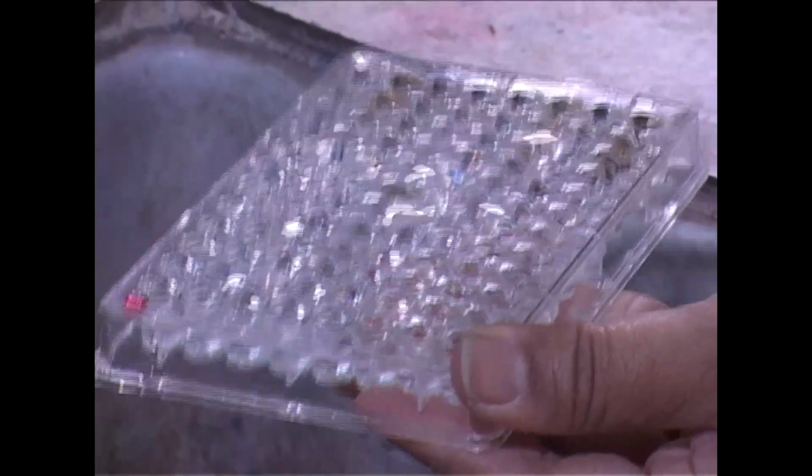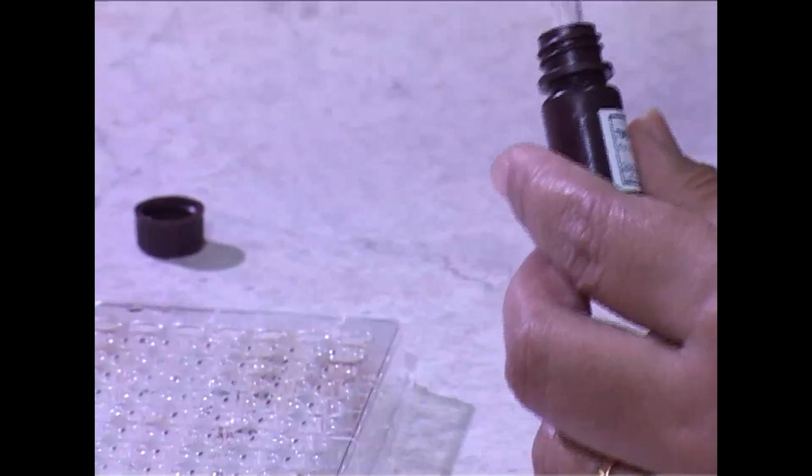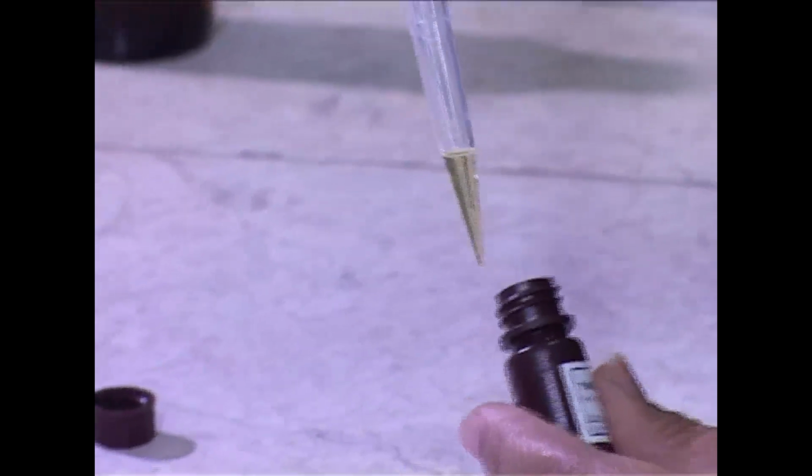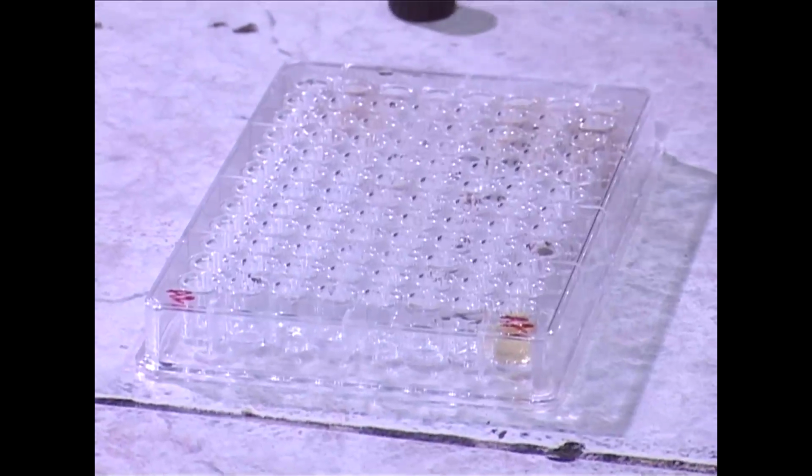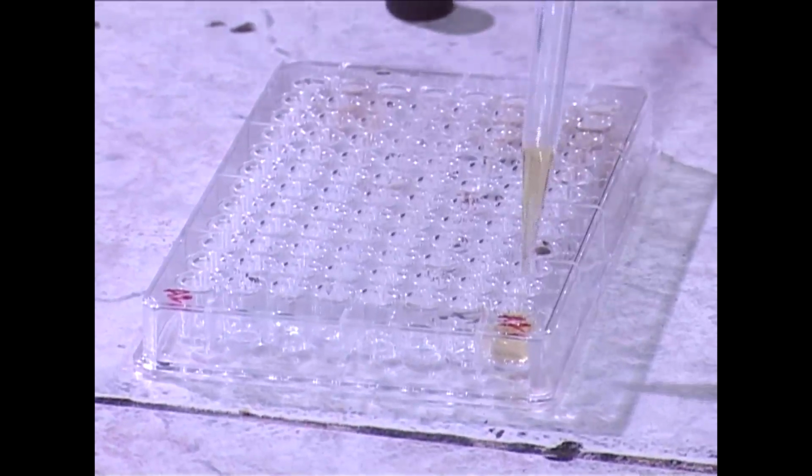Again, after proper incubation time, we have to wash the wells. Then we add the specific substrate. After some time, say after 10 minutes, we have to stop the reaction with either alkali or acid. This stopping of the reaction is very important, because enzymes act as an amplifier. If only a few enzymes are present in a well, they can convert all the substrates into products.